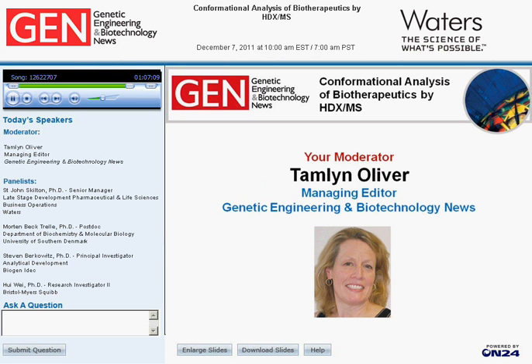But for regions that are very dynamic, where the protection factor is very low, I would expect a correlation, because then there would also be some static disorder in the crystal that would be reflected also as very fast exchanging amides in solution. So again, for very flexible regions, I would expect a correlation, but as soon as the protection factor exceeds 1,000, there's no correlation.